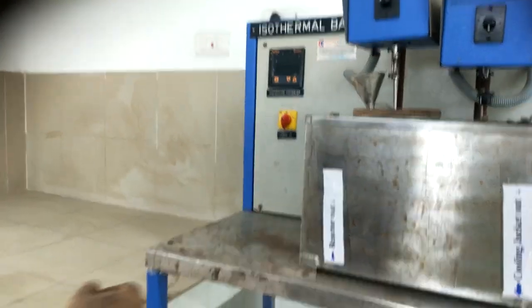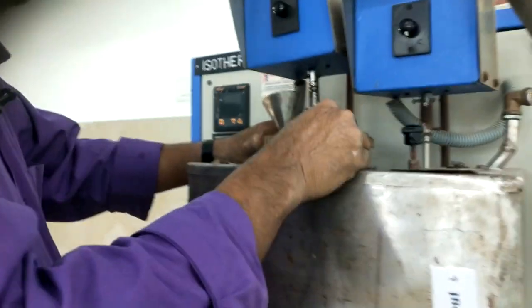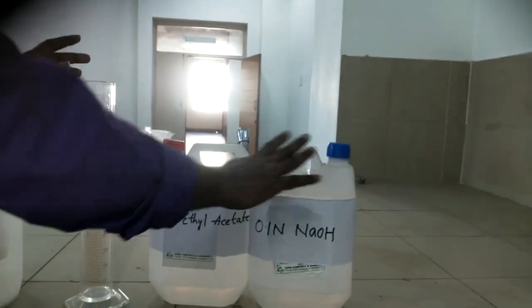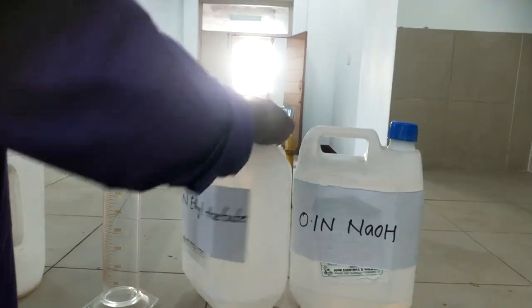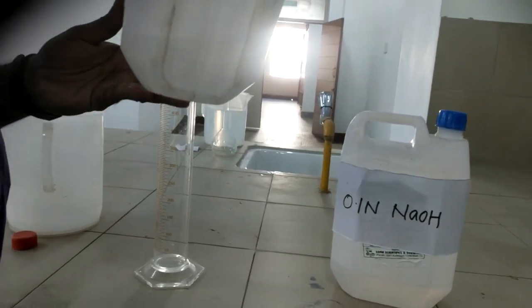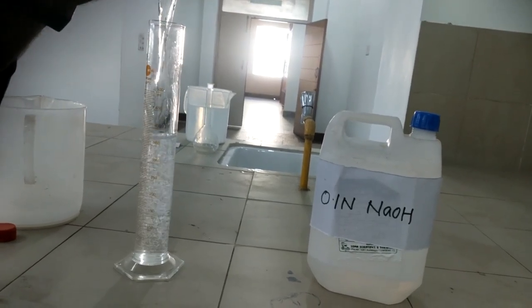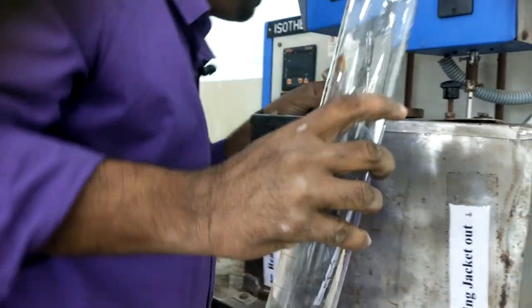So now into the reaction vessel we are going to fill the reactants into the system. We will take 500 ml of 0.1 normal ethyl acetate.